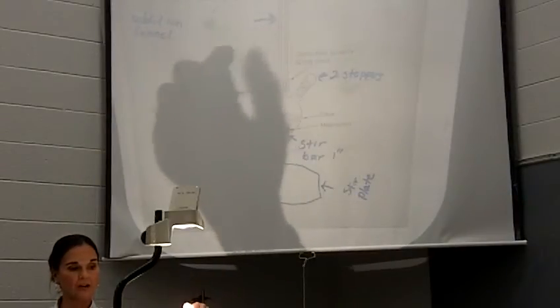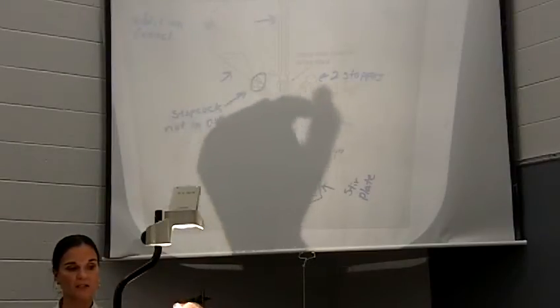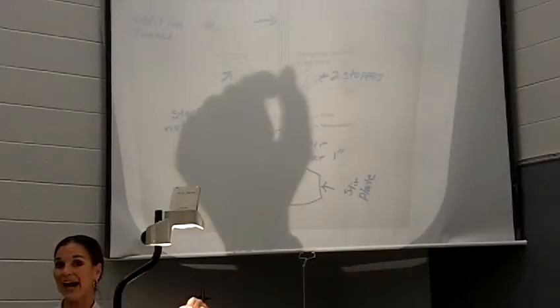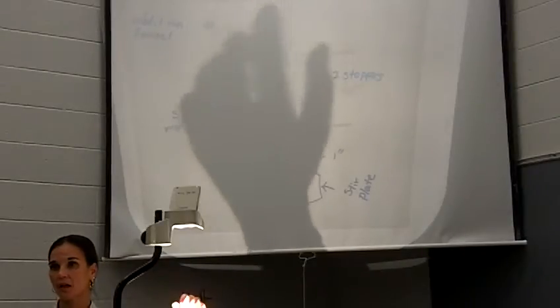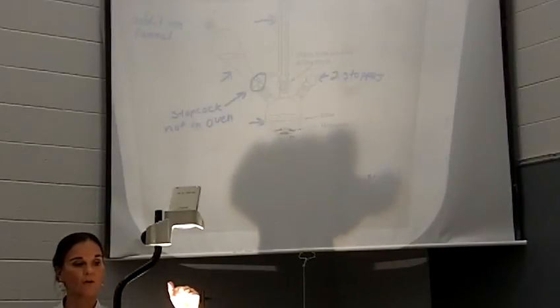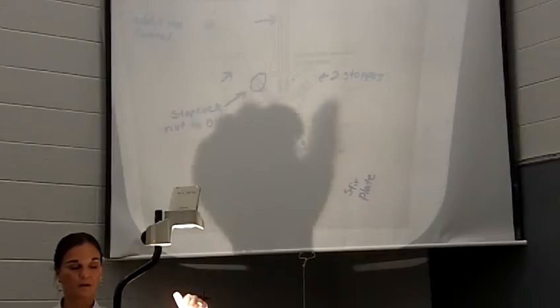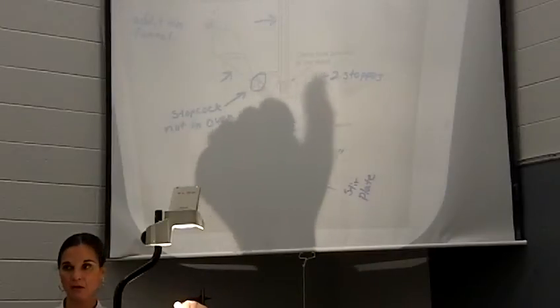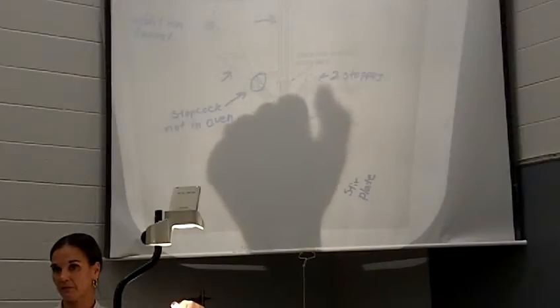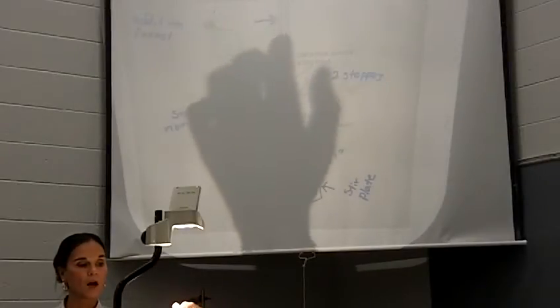You want to add your alkyl bromide dropwise, but keep the contents of your flask refluxing. You don't want it to stop. If it stops, it's hard to get it going again, okay? So you want to keep it refluxing. At any point along the way, if you are not certain what should be happening here, things don't look right, grab your instructor so they can look at it, okay?